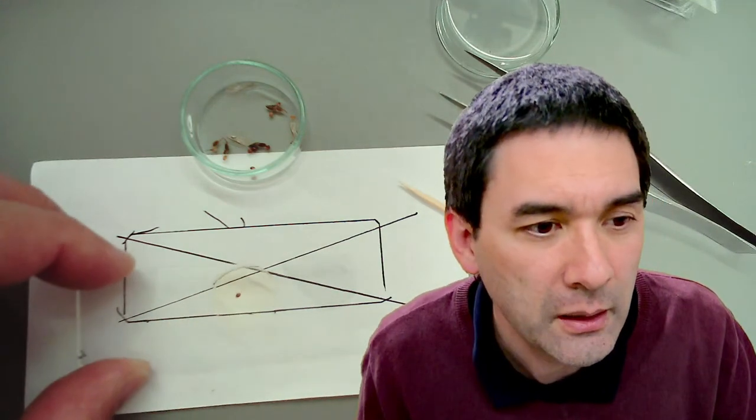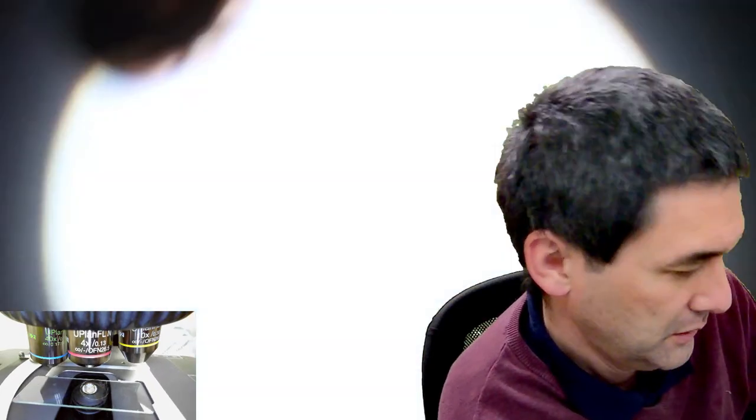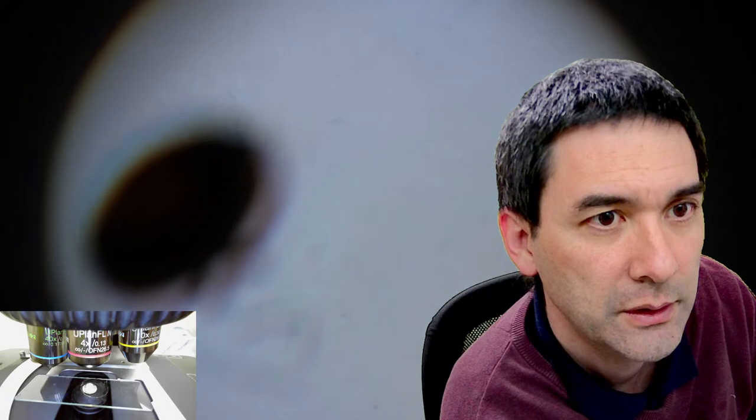Okay, so I'm just going to switch over to the microscope again. It goes in here. Of course, I have to center it, and I have to turn on the light. Here it is. I have to swing out the filters. Of course, it is very blurry, but that's also okay.